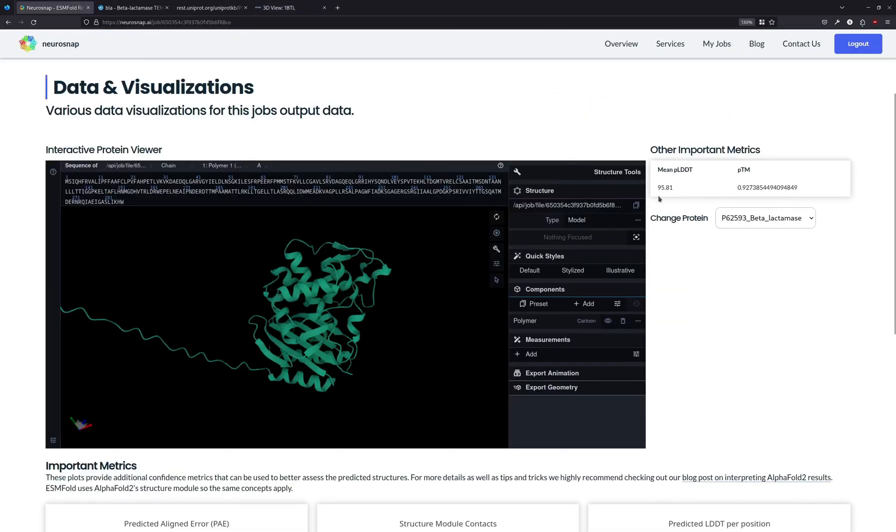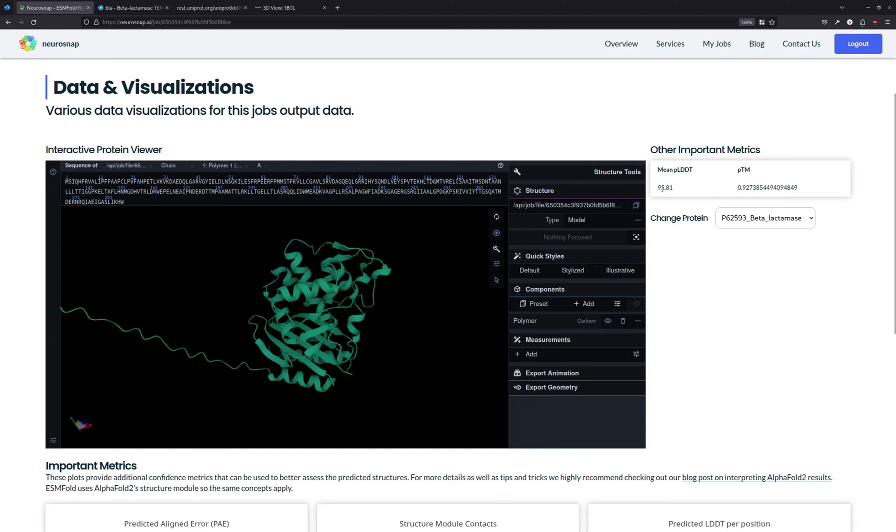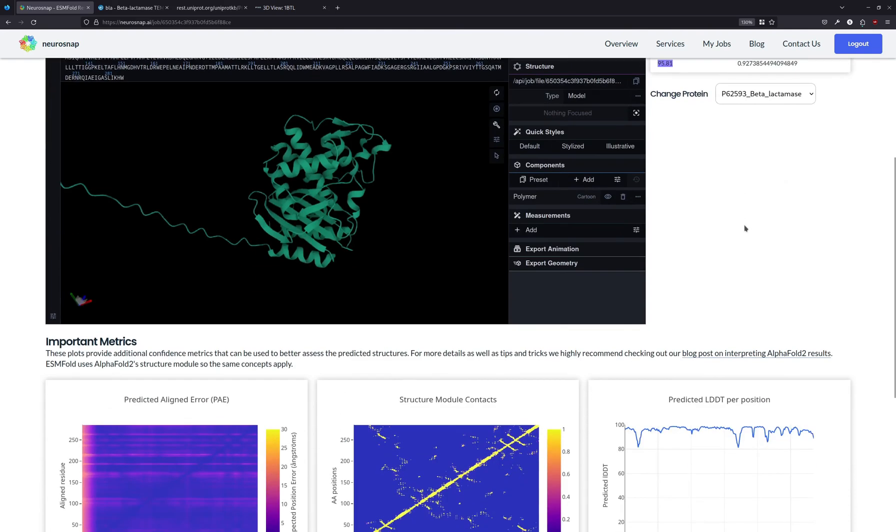Additionally, for cases where you don't have a reference structure to compare to, the mean PLDDT and PTM values can usually be used to infer the quality of a prediction. The PLDDT ranges between 0 and 100, and over here it tells us that this is a great prediction. Anything above 90 is a fantastic prediction. And same thing with PTM—it ranges between 0 and 1, and anything above 0.9 is also a fantastic prediction.